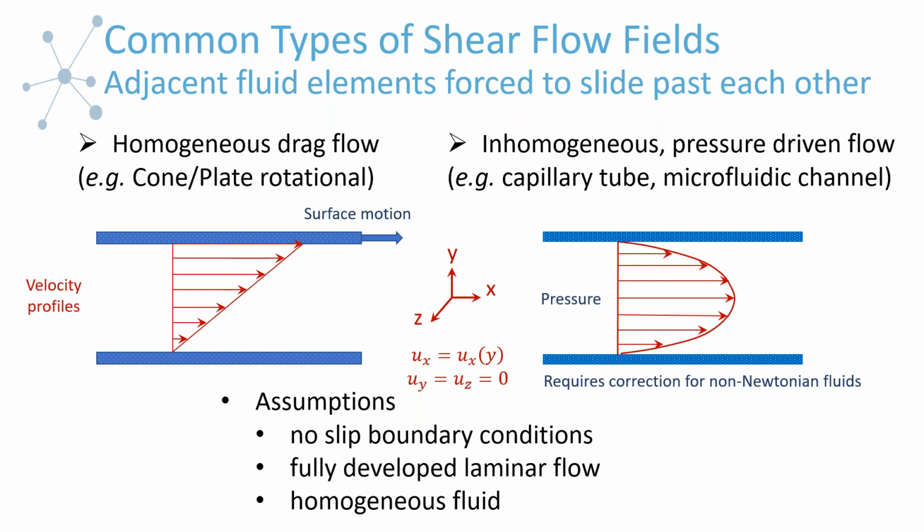The laminar part comes in in that we want the unidirectional flow where you have the streamlines that aren't crossing each other. So that is very much represented by our drawing of the velocity profile. When you get to high enough rates in certain types of instrumentation, depending on the characteristic length scale, and that characteristic length scale is generally going to be the gap between the plates or the fluid height, you can see this transition from this laminar flow to what's referred to as turbulent.